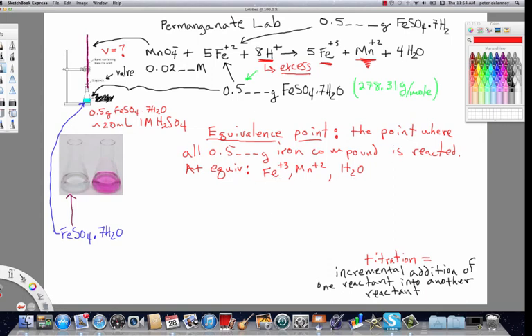Now, if you're doing this experiment correctly, literally at the equivalence, this burette should be shut down, because as you get closer to the actual place where you reach the equivalence, what you're going to notice is that for each drip of permanganate you put in here, the pink color that's shown here on the right, which I'm going to address in a second, will be flashing through this solution and holding its coloration for longer and longer periods of time.